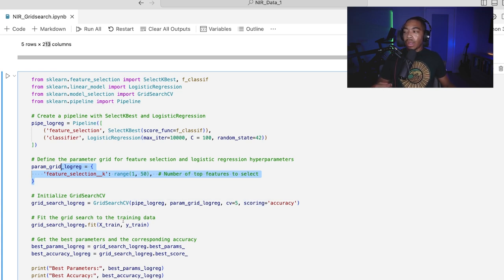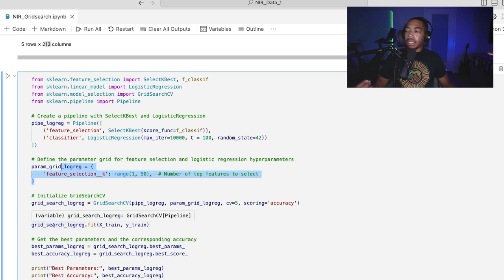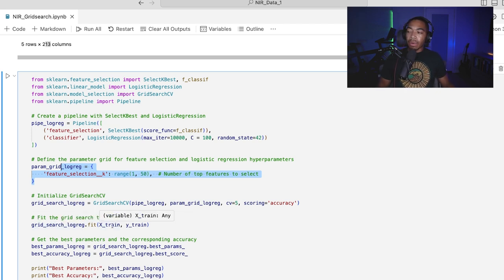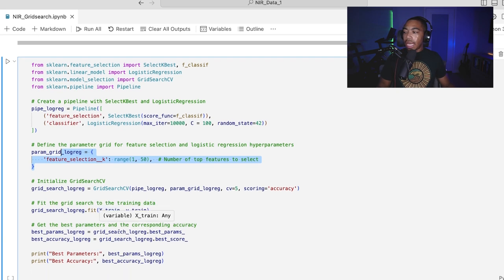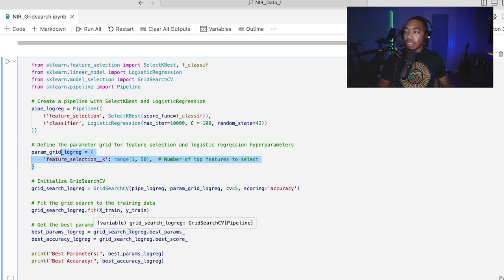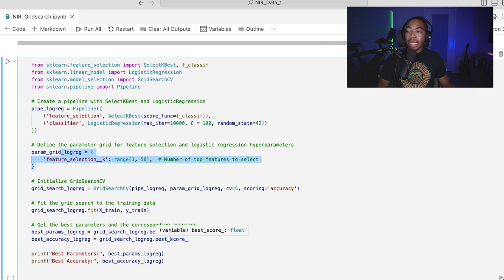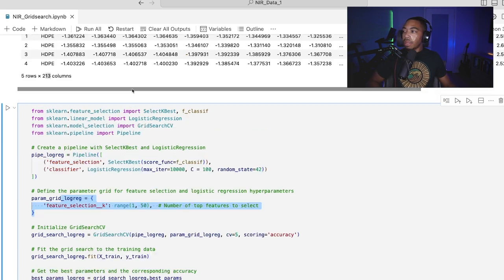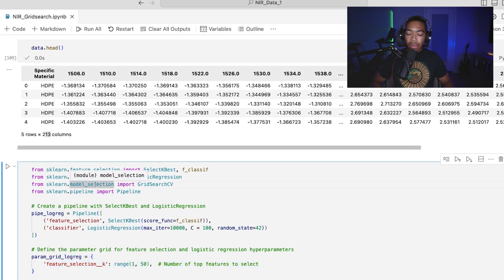Once we do that, we automatically get this new model object here. And that is the grid search log reg, and we can fit that model on the entire training data, and then return the best parameters as well as how well this model performed indicated by the best score.